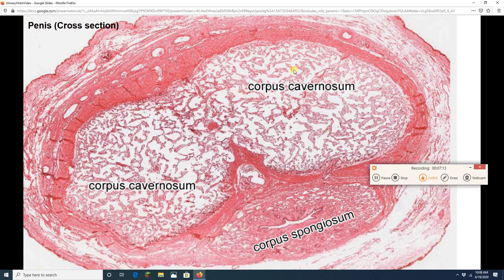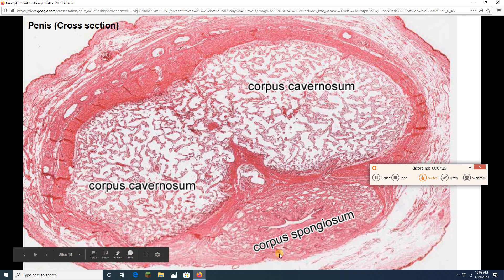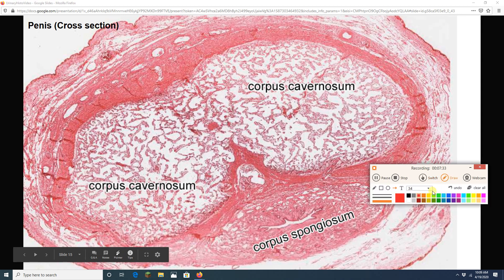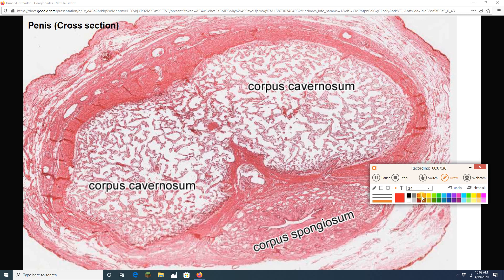There are two big dorsal ones. Each is called a corpus cavernosum. So there are two corpora cavernosa. And then there is a single ventral erectile tissue called the corpus spongiosum. Erectile tissues are filled with vascular sinuses that can become engorged with blood leading to an erection. And in the middle of the corpus spongiosum we are going to see a kind of squished tube that is this penile or spongy urethra.